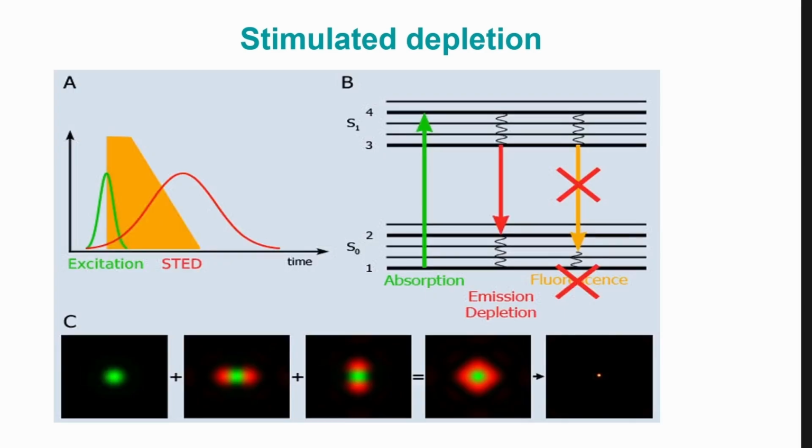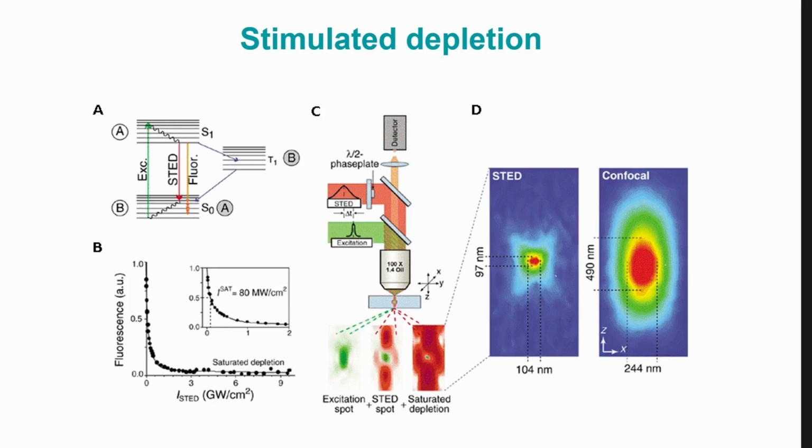So if I look at my spectra in cross section, then this is what it looks like. And my effective point spread function is now this. So from this point spread function, I went to that on the excitation. I did not touch the emission side. I'm still happy with what I have. So when I compare the actual point spread functions, the excitation side one, I go from the diffraction limited confocal to the STED limited, much smaller point spread.